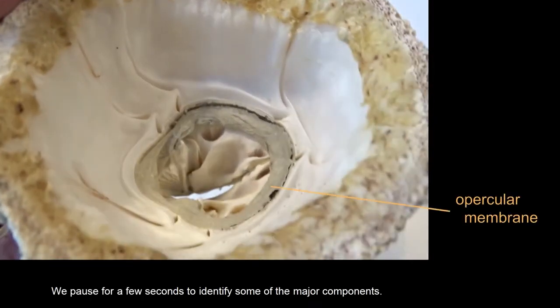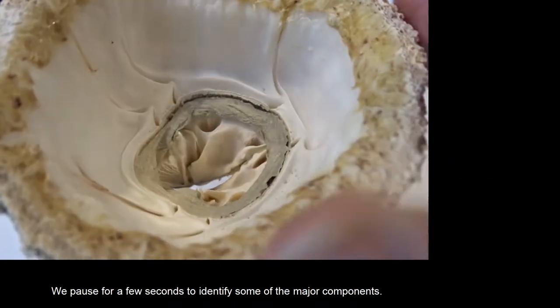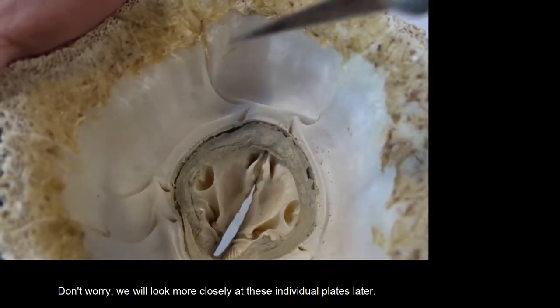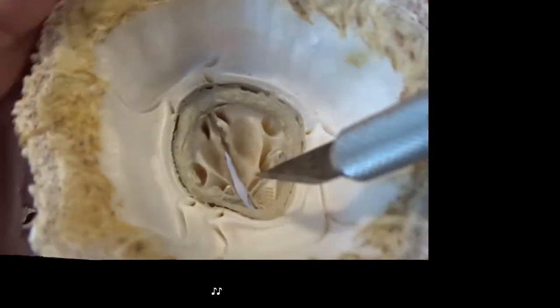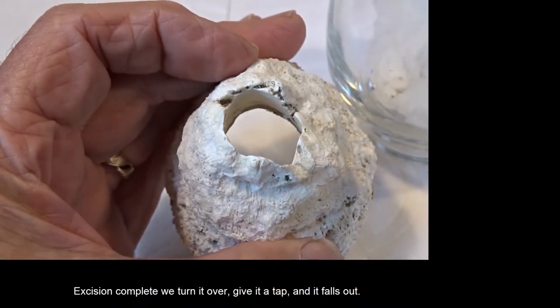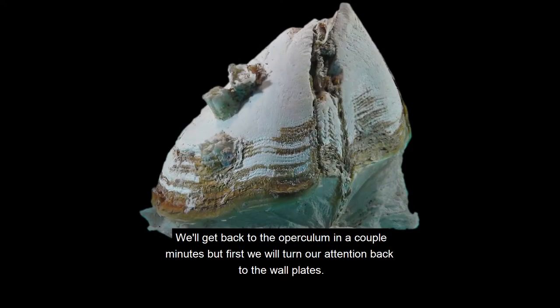We pause for a few seconds to identify some of the major components. Don't worry, we will look more closely at these individual plates later. Excision complete — we turn it over, give it a tap, and it falls out. We'll get back to the operculum in a couple of minutes, but first we will turn our attention back to the wall plates.